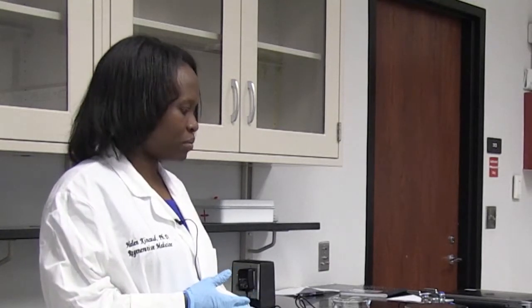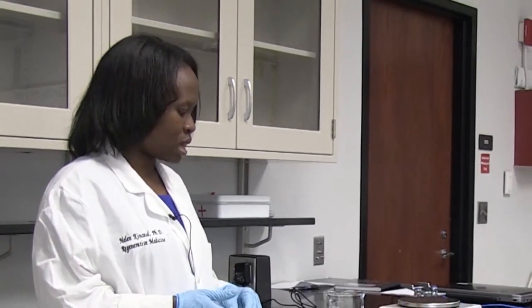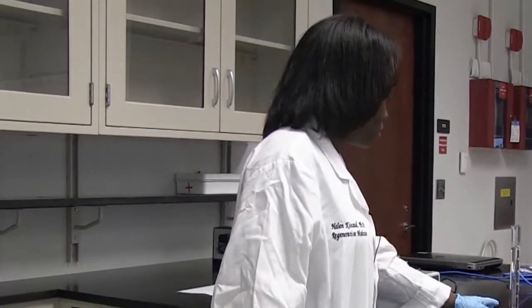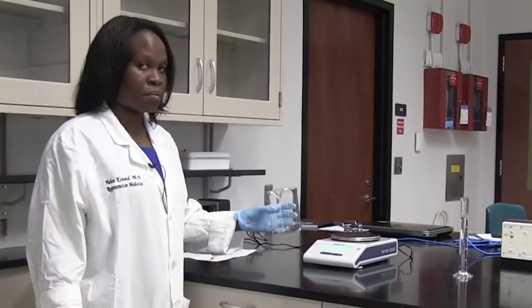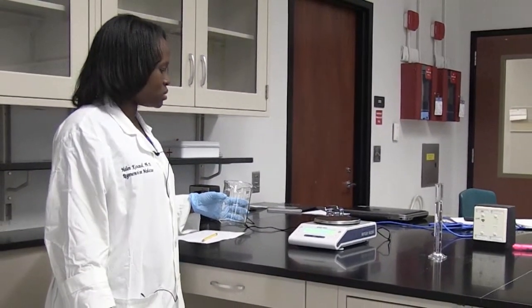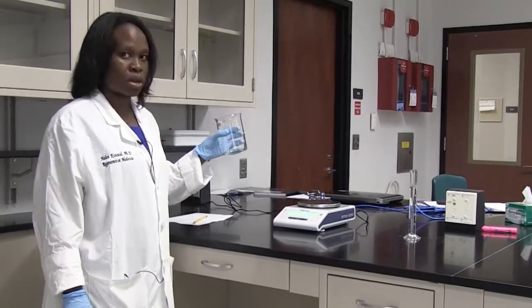In order for us to determine the density of water, we have to determine its weight and its volume. So in order to do this, I'm going to actually weigh 50 milliliters of water by placing it into a beaker. So in order to do this, I first have to determine the weight of my beaker.